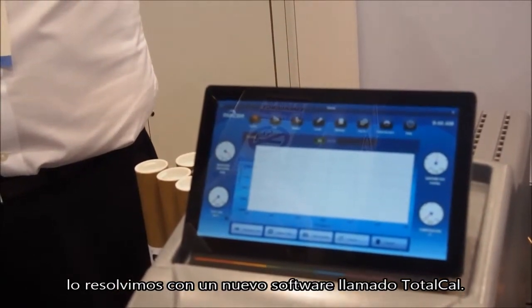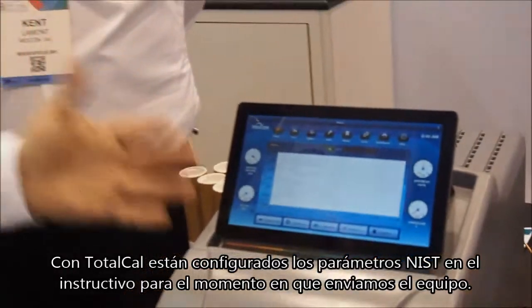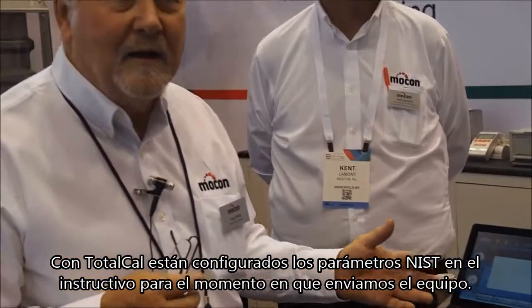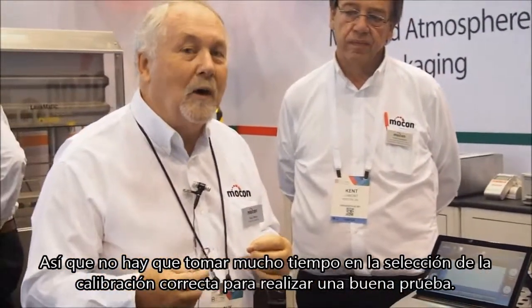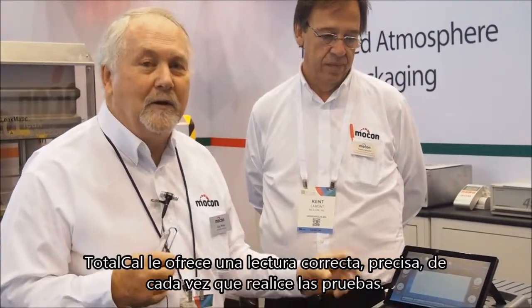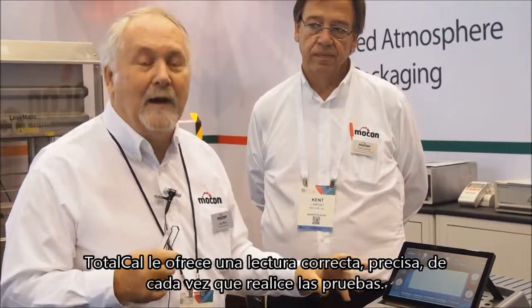We solved it by coming up with a new piece of software called Total Cal. Total Cal puts all of the NIST points into the instrument when we ship it, so that you no longer have to select your correct calibration in order to get a correct test. Total Cal will give you a correct, accurate reading every time.